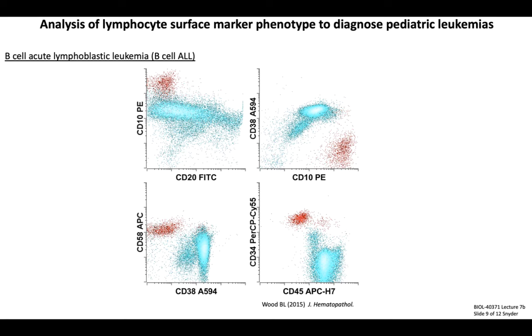Flow cytometry phenotyping of lymphocytes in these patients following initial diagnosis helps to definitively establish a diagnosis of B-cell ALL because it can provide additional information on the patient's B cells beyond basic morphological readouts such as blast morphology. This information can then be compared to marker expression phenotypes that are considered characteristic of this form of B-cell malignancy. And these are based on the abnormal expression of several surface markers that are not usually co-expressed in healthy B cells subjected to properly regulated B cell development pathways.